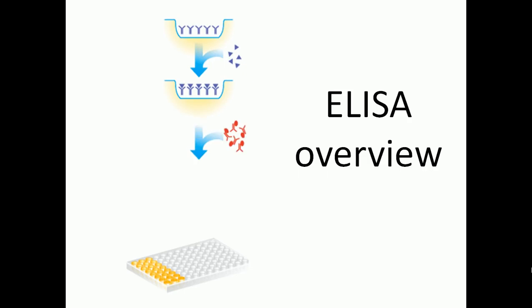Once they adhere there, we do a washing stage each time, for the unbound antigens to be washed away. After that, the second and most important part of the reaction is to add another type of antibody which is again specific to those antigens, but this time the antibody has an enzyme linked with it. For example, if you see here, these are again red Y-shaped antibodies, but they are attached with some kind of circular red dots, and those circular dots are nothing but enzymes. Now these enzymes can interact with a particular type of substrate to convert that substrate into a colored product which we can visualize.